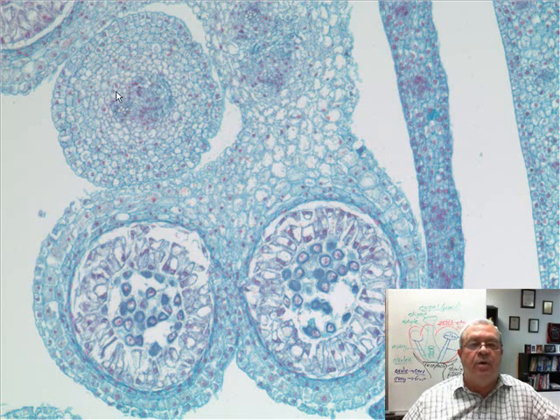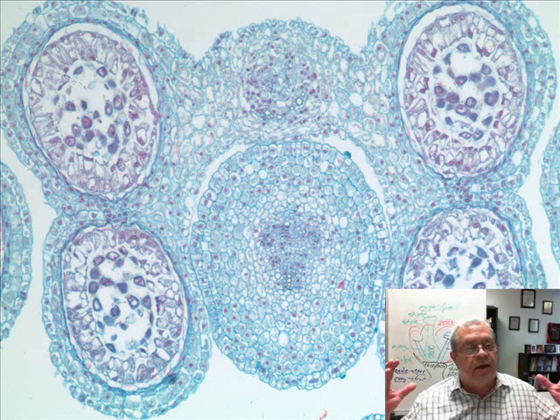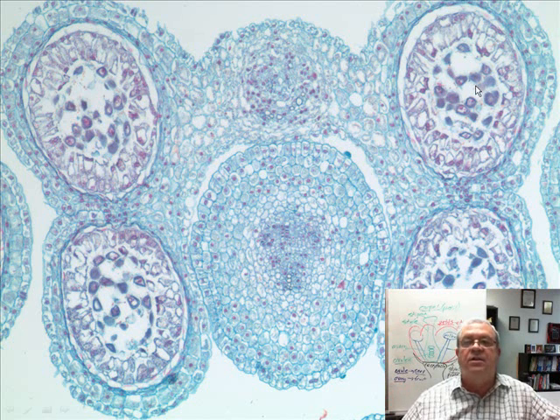See, how come we can see the filament? I'll answer that question with the next slide. But how many sacs does an anther have? It has four. We see one, two, and then part of a third one right up here. But let's look at an anther straight on, actually looking at all parts of the stamen. And so here we have an anther with its how many sacs? 1, 2, 3, 4.